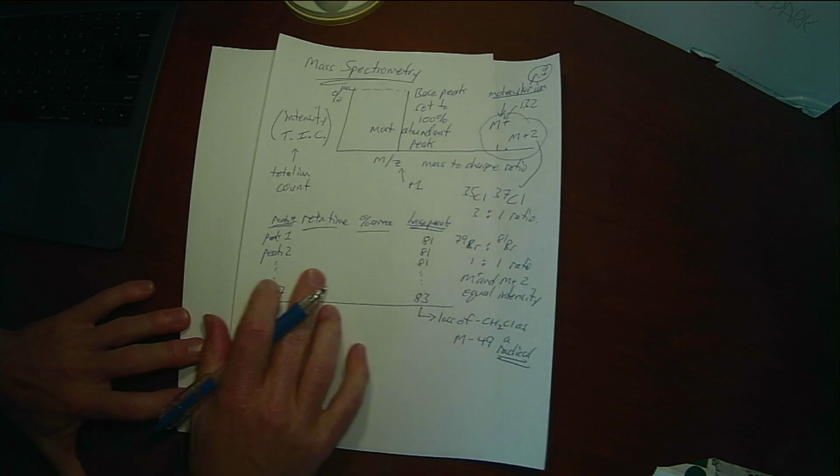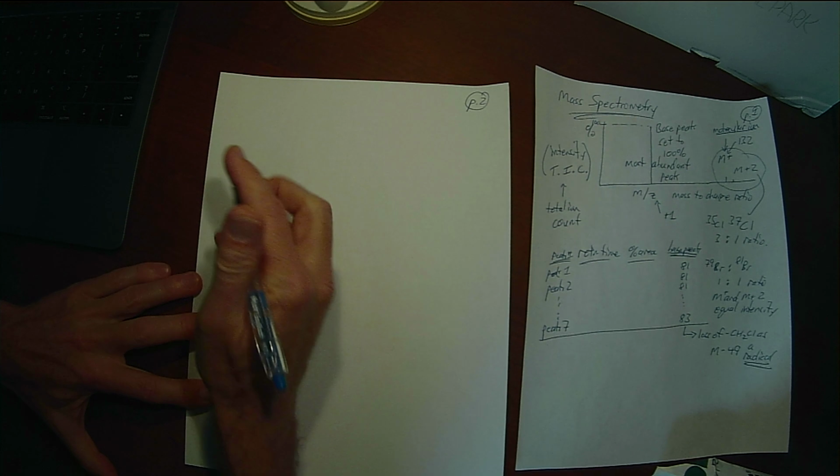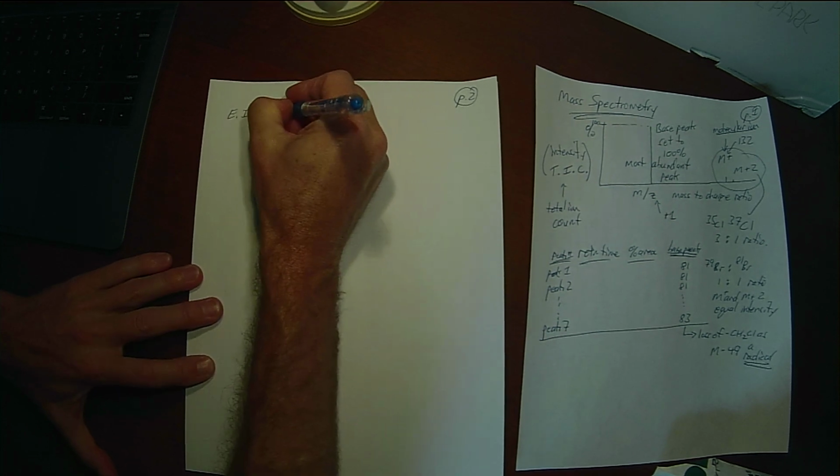So what happens when we do a mass spec? There are various types of mass spectrometry, but the type we're doing is called EI. That stands for electron impact.